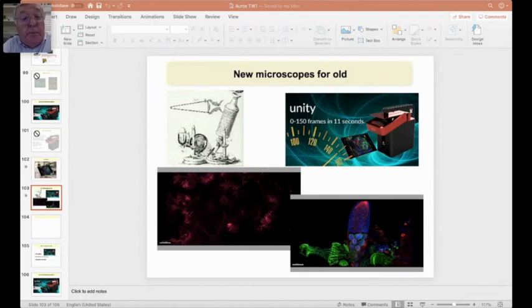You know, to build a proper beam scanner. Oh, wait one moment. The other people who built beam scanners very early on was the Japanese company Lasertech. And they had a hybrid scheme.